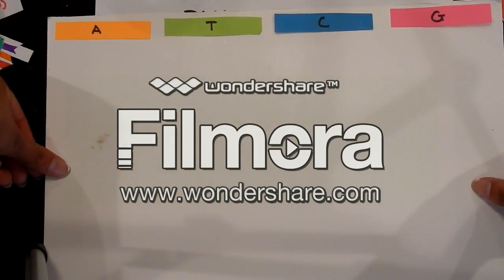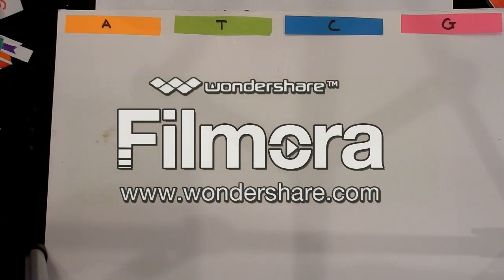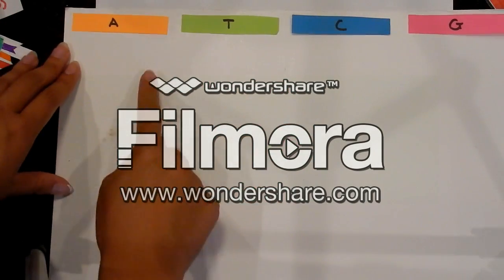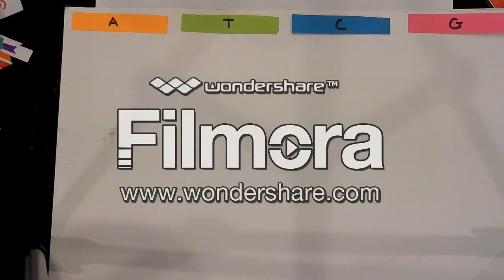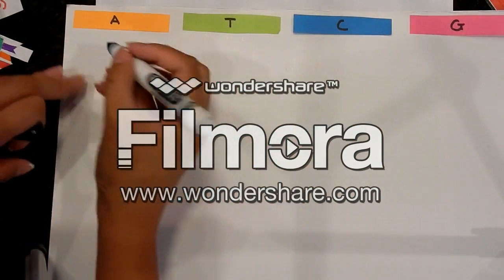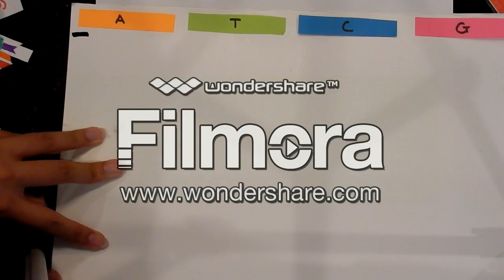So let's say this is a field of gel electrophoresis. And since we had 4 different test tubes, we're going to have 4 different lanes, one for each test tube. Now, at the top where the DNA samples are placed, it has a negative charge, whereas the bottom portion right here would have a positive charge.